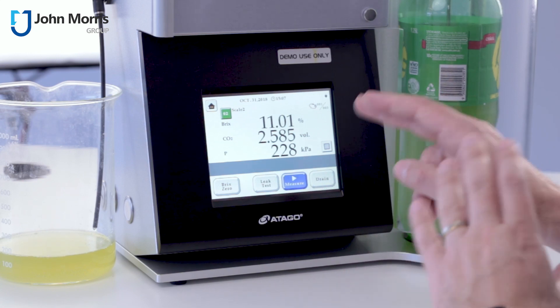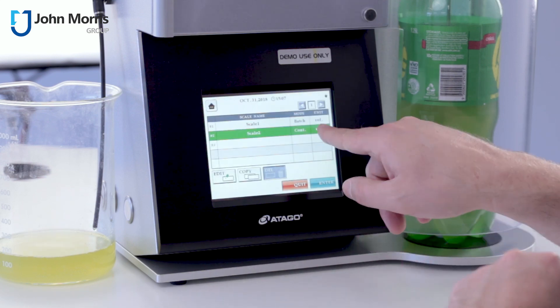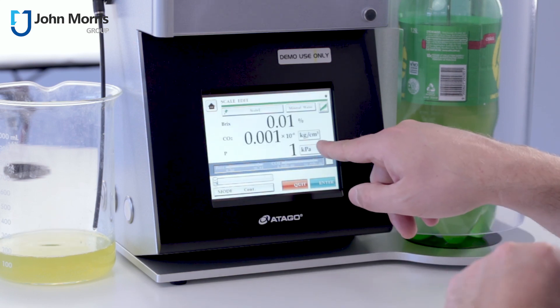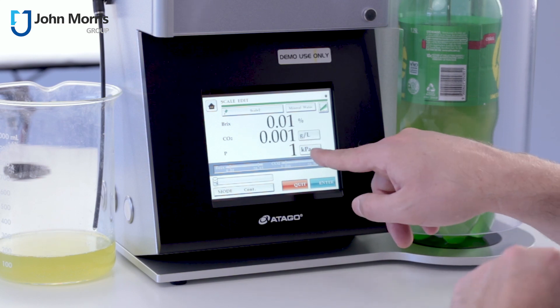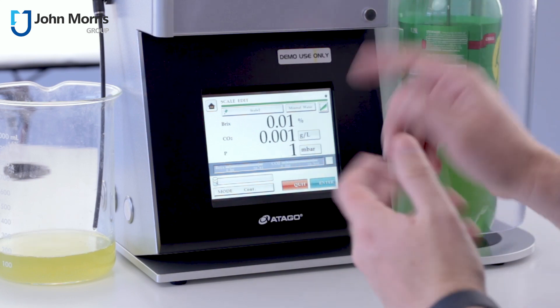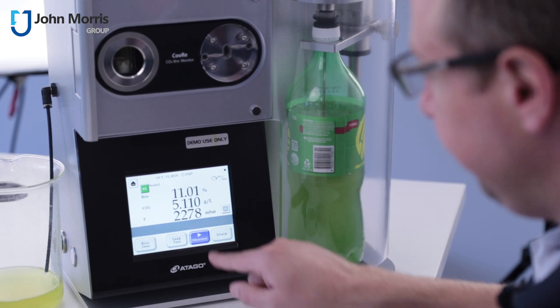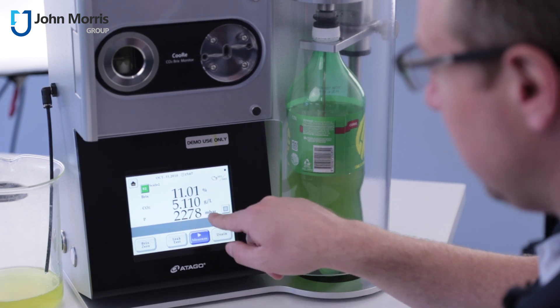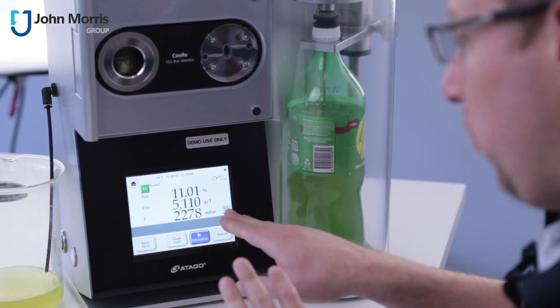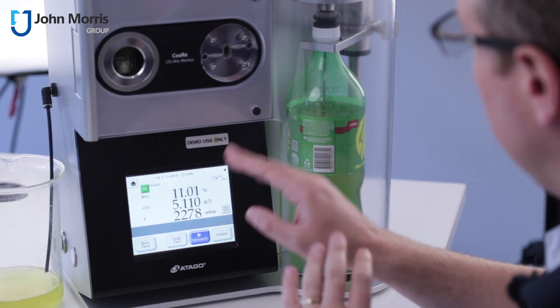Now, if that doesn't mean anything to you, you can go right here and change your scales. If we edit that, we can change from volume to kilograms per centimeter cubed or to grams per litre, from kilopascals to bar — which I personally prefer — or millibar, which is possibly even better. Hit enter and it will convert it for you. So 2,278 millibar — atmospheric pressure is about 1,014 — so I really like it displayed in that format.